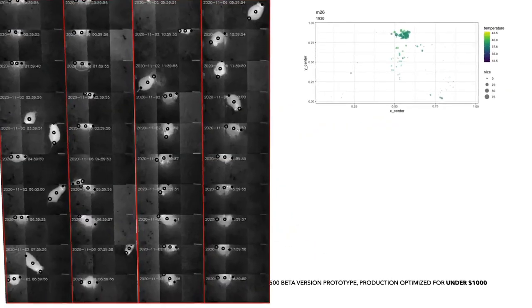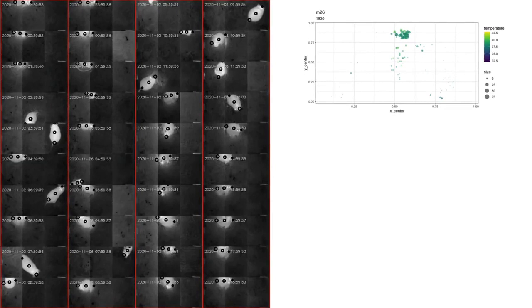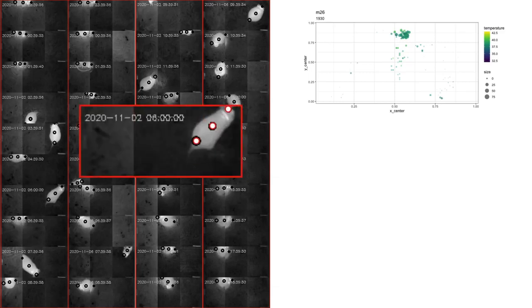That's why the way the system works is a combination of hardware optimization and software designed to reveal important information that is not obvious from short-term observation. Real-time raw data using thermal and infrared sensors are captured and sent to the cloud for processing.